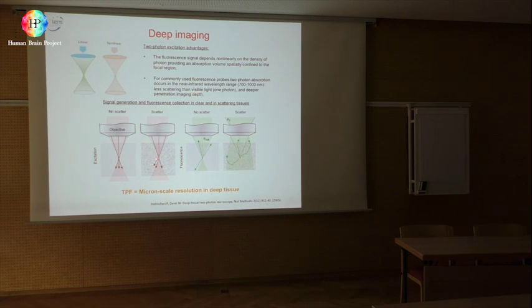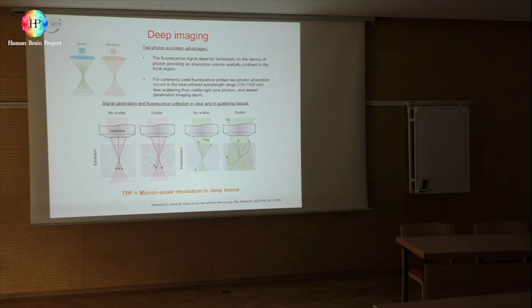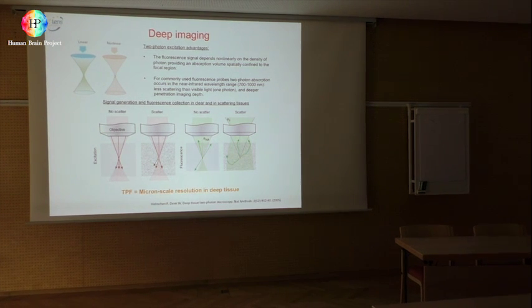In two photon, if you enlarge the volume, you lose the power density, you do not excite anymore. And so the threshold of excitation always remains pretty much confined to 1 femtoliter, also with scattering. So what you lose in two photons is just signal, not resolution. But this is easy to recover. You just increase the laser power and then you recover your signal.